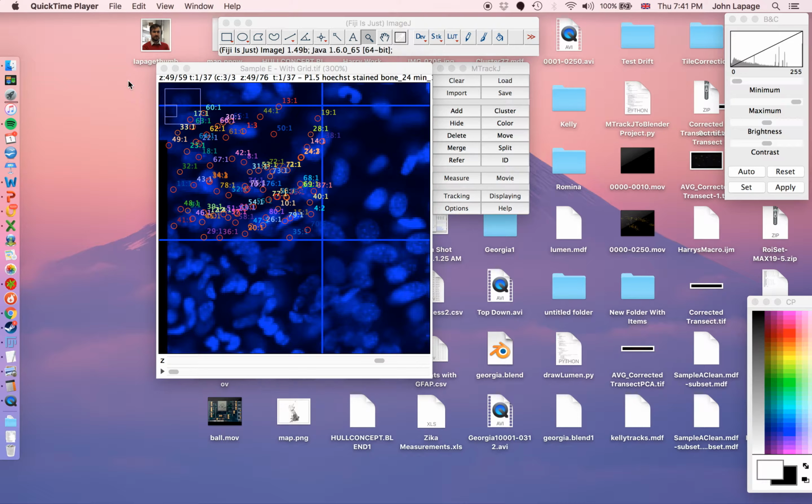So if you've got one division, you'd have a total of 4 tracks. If you have two divisions, you have a total of 7 tracks. Sorry, 3 divisions, you have a total of 10 tracks. So in order to find where this might have gone wrong, we need to see the number of tracks per cluster. And it's really easy to do.